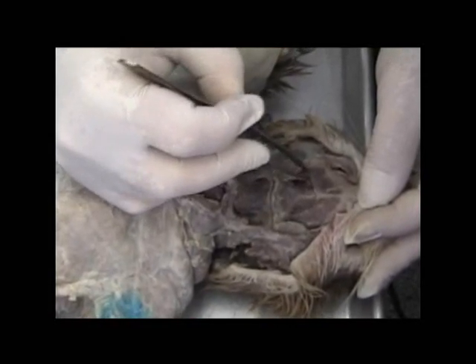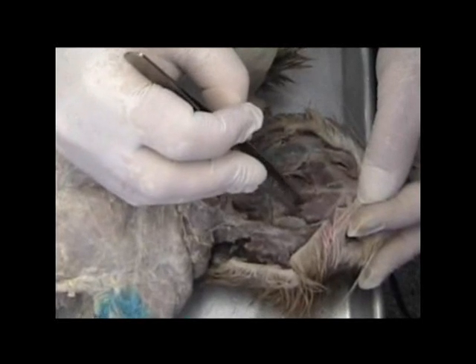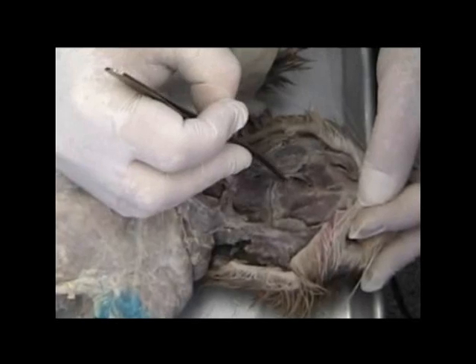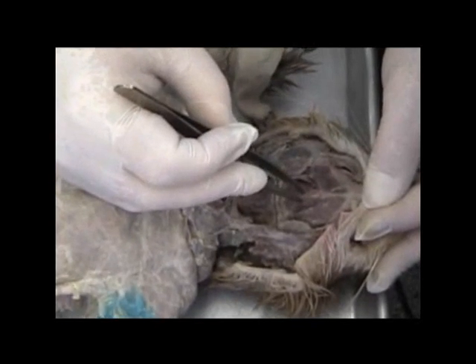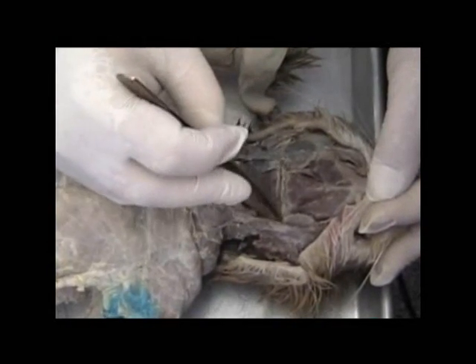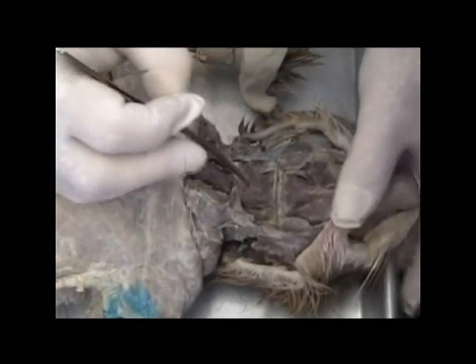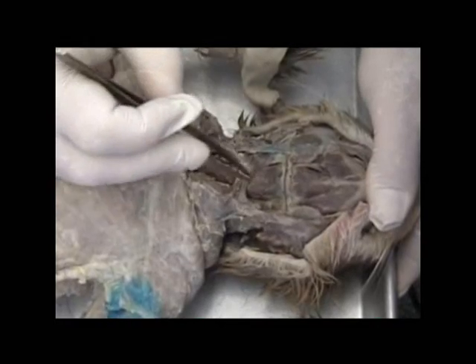Left digastric, right digastric. If you look at the muscle below that and partially covered by these two muscles whose fibers run this way, transversely across, and you can see the linea alba running down through that, these are the mylohyoids. Here we find a landmark which is a vein running across connecting the two jugulars. This is a transfacial or transjugular vein. Approximately underneath that is going to be a hyoid bone.